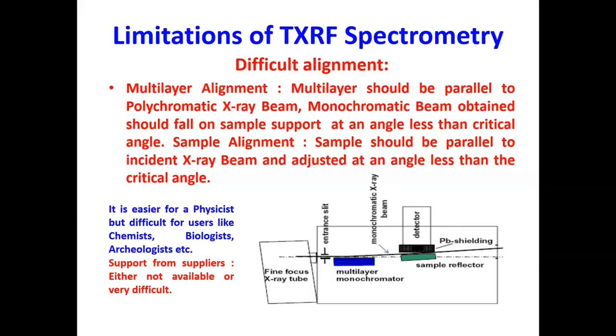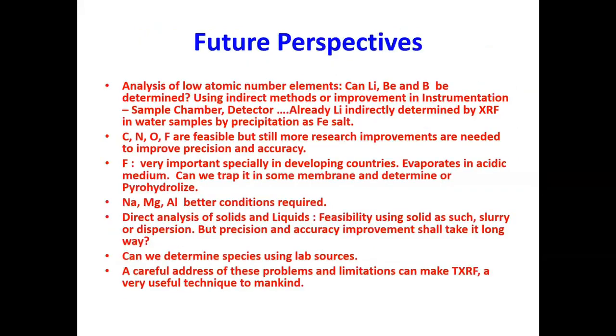And the suppliers, they don't say anything about the alignment problem. They show the electronics. They solve the electrical problem. But if you say alignment, they just raise their hands. So this, we as a TXRF community should handle.